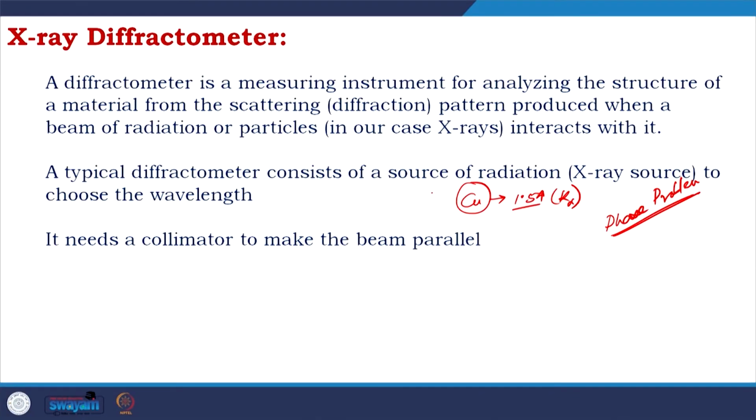It needs a collimator to make the beam parallel. We already know about the collimator and how it works. It contains a setup for sample holding.